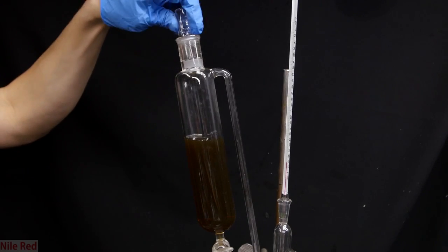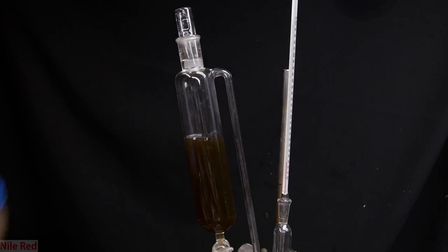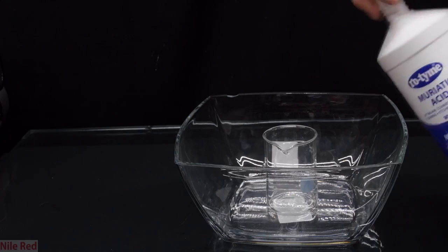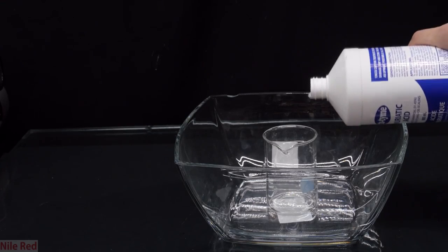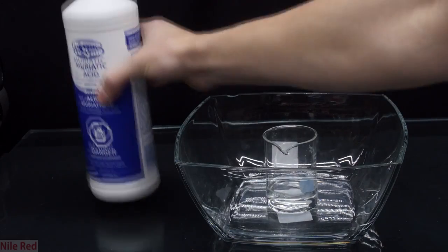So with that being said, I'm going to get started and we'll start with muriatic acid, also known as hydrochloric acid. So here we have some 31.45% hydrochloric acid that I bought from the store. To start off, I pour a little bit into a beaker.